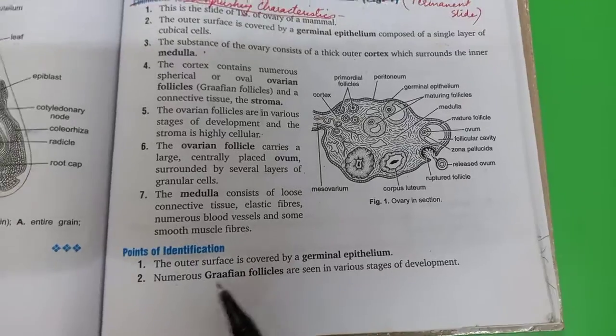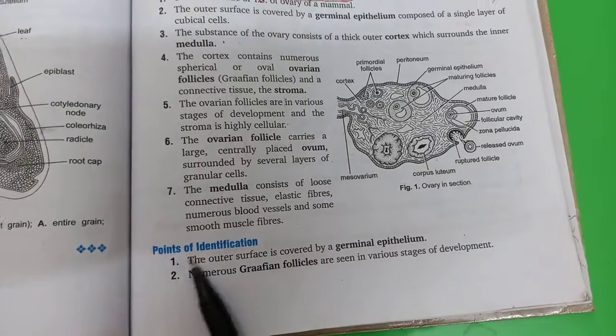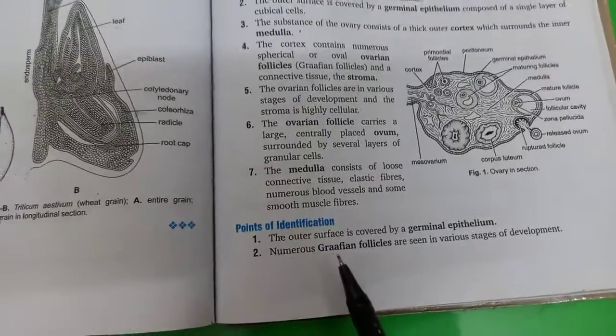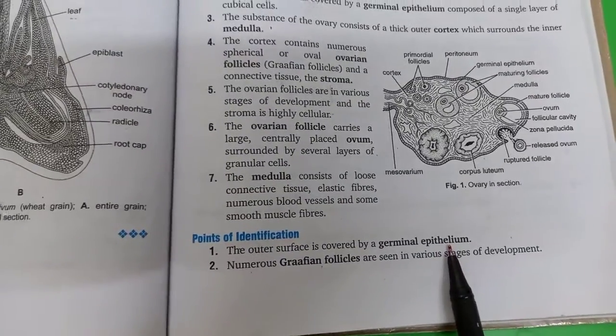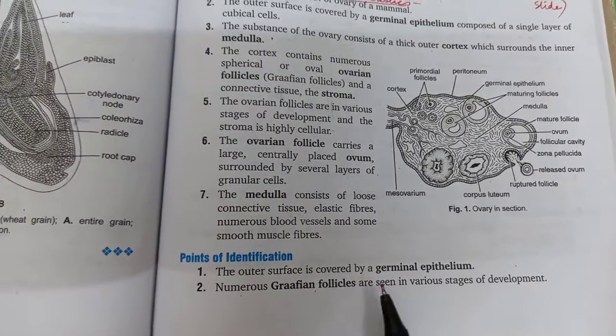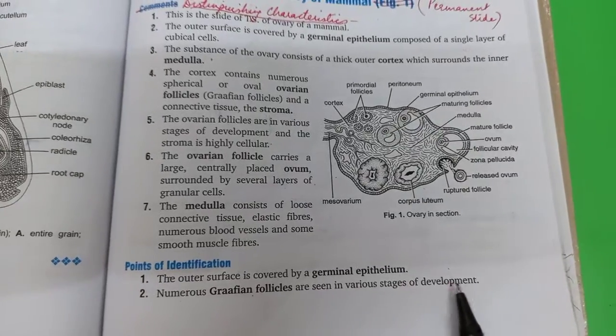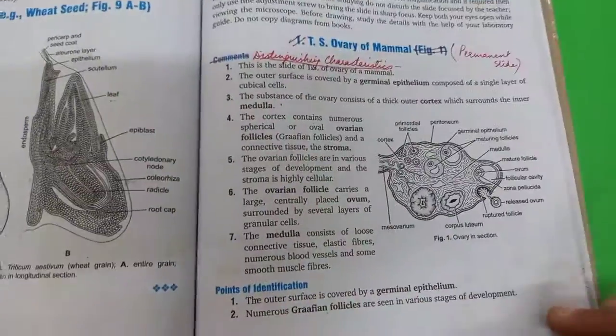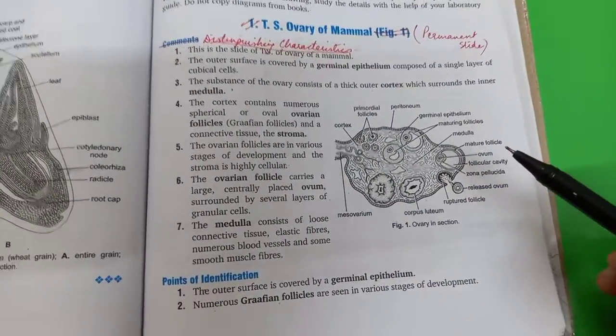After that, you will write another heading, points of identification, after leaving one line. The outer surface is covered by germinal epithelium and numerous Graafian follicles are seen in various stages of development, right? So this is all for practical number 8 for today.